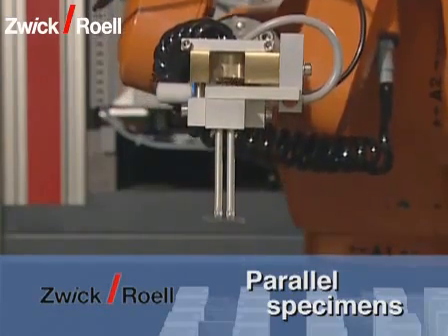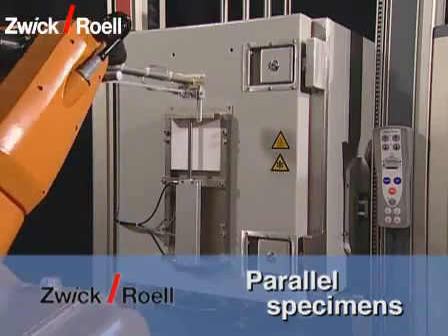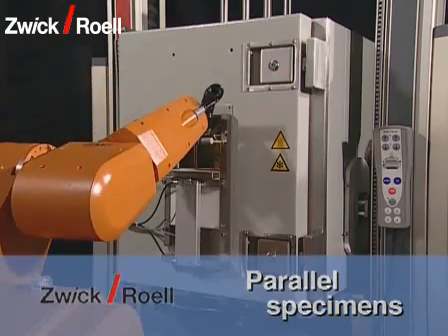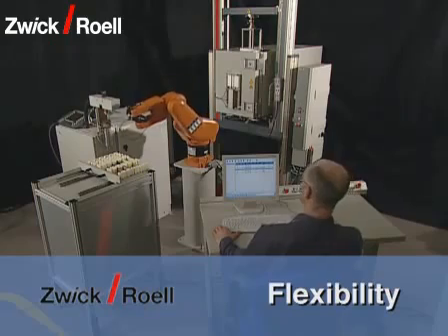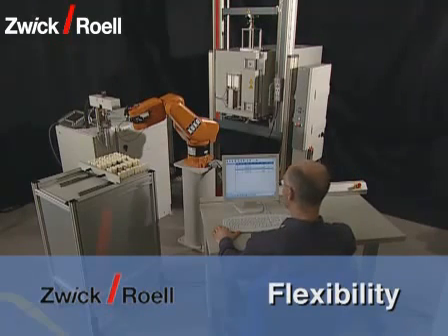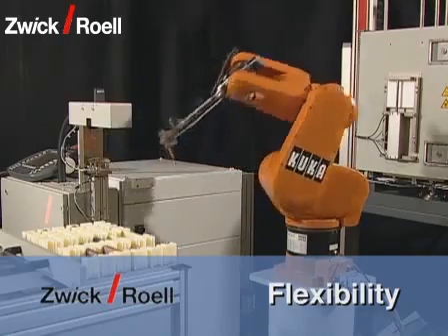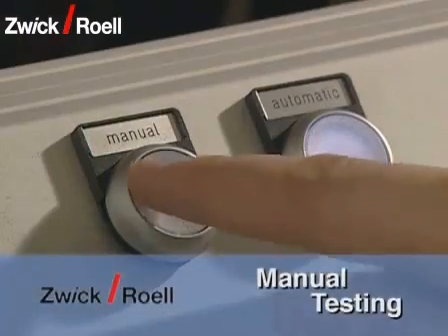Several specimens are run in parallel within the system. In extreme cases, one specimen can overtake another one within the system, which has a positive effect on the rate of tested specimens. Due to the arrangement of the device in a circle with the robot at its center, enlargement is possible at any time. For example, it is no problem to integrate a barcode reader.